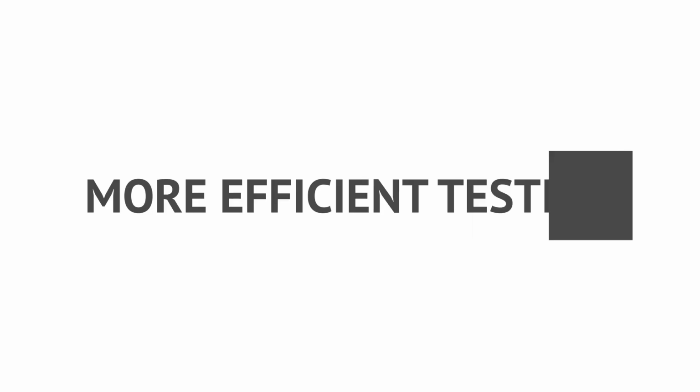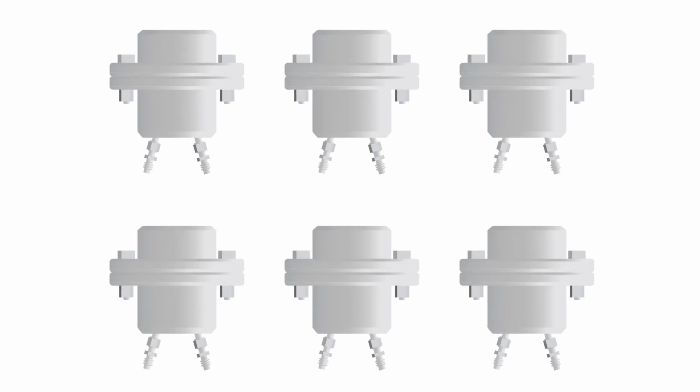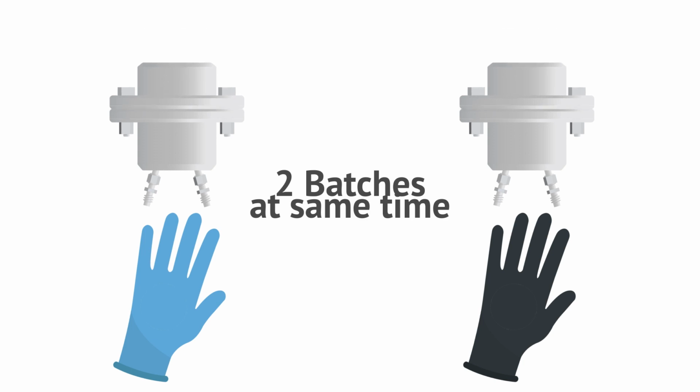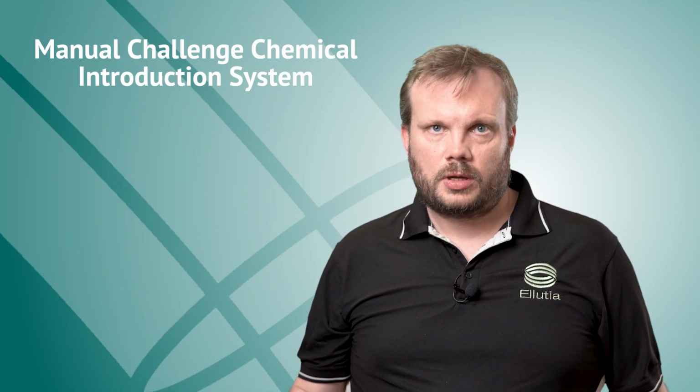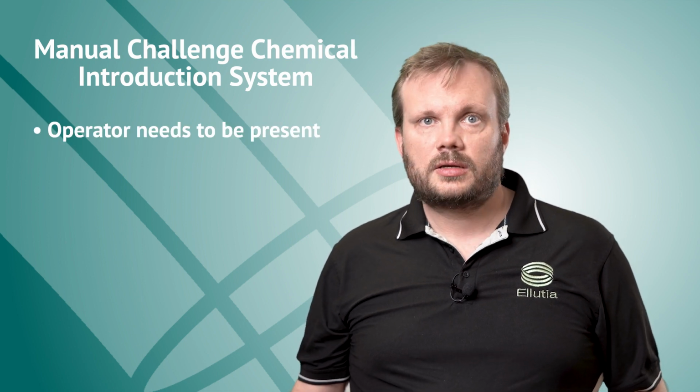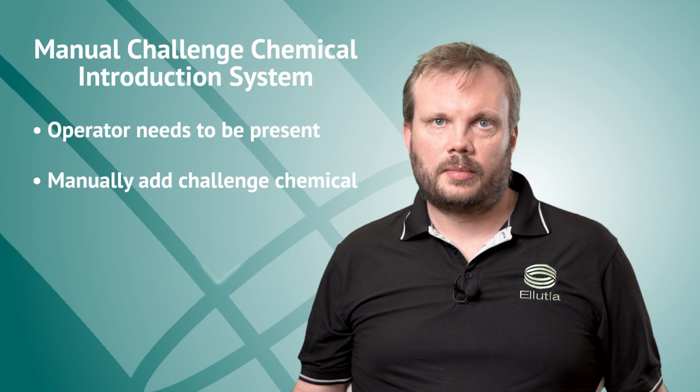To make the testing process even more efficient, for materials with a longer expected breakthrough time, we can take it one step further and test using 6 cells simultaneously, with each cell being tested every 6 minutes. This allows you to run 2 different batches of samples at the same time, saving you even more time and increasing the efficiency of your testing process. It's important to keep in mind that this is a manual challenge chemical introduction system, which means an operator needs to be present when the experiments begin and end to add the challenge chemical at the appropriate time.